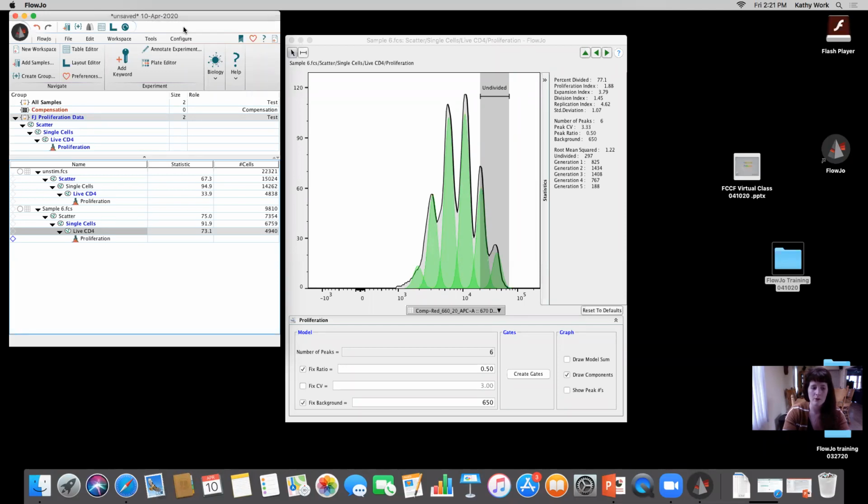I know that I've had experience working with polyploid cell sorting of live hepatocytes for some users, and the name of the drug is escaping me at this point. The researcher used Hoechst, and we worked with them to optimize their assay with the addition of a certain reagent to prevent the efflux of the dye.